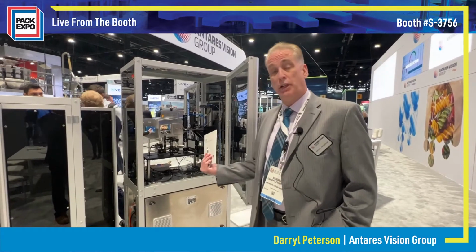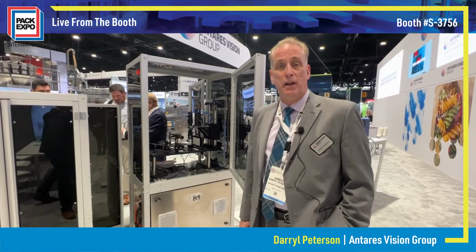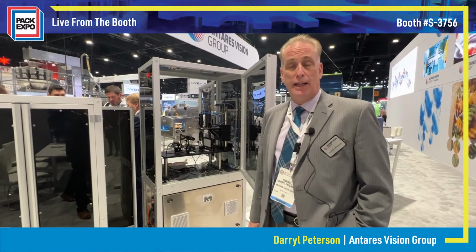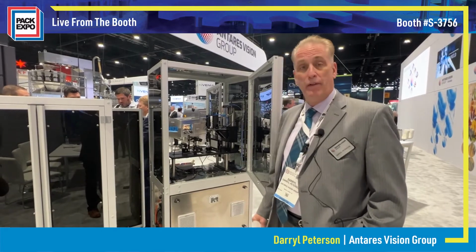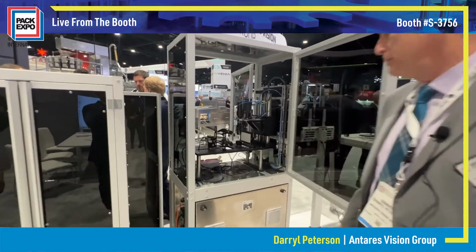Today we're going to show you a little bit about our development system, a benchtop development system for developing inspection on various products and containers for automated inspection. This system that you're seeing here today is set up for vial inspection, and I'll point out some of the things that you see inside the machine.